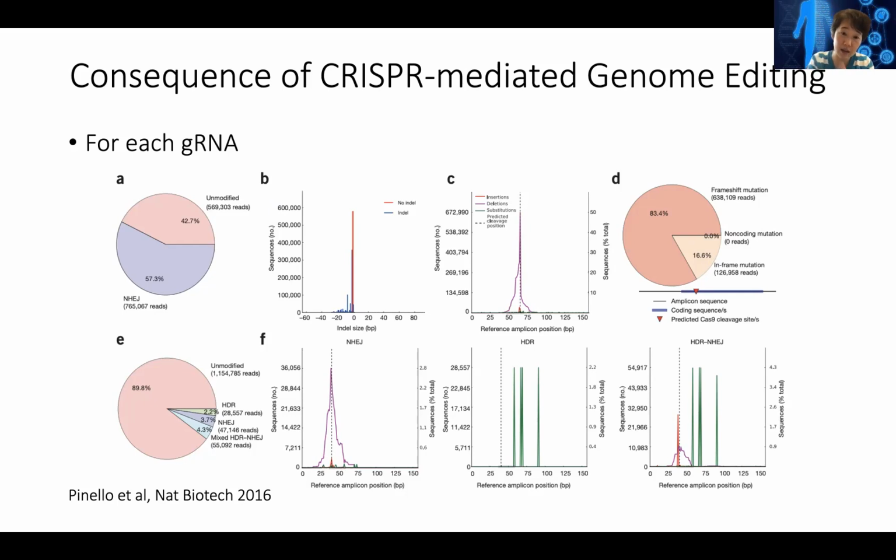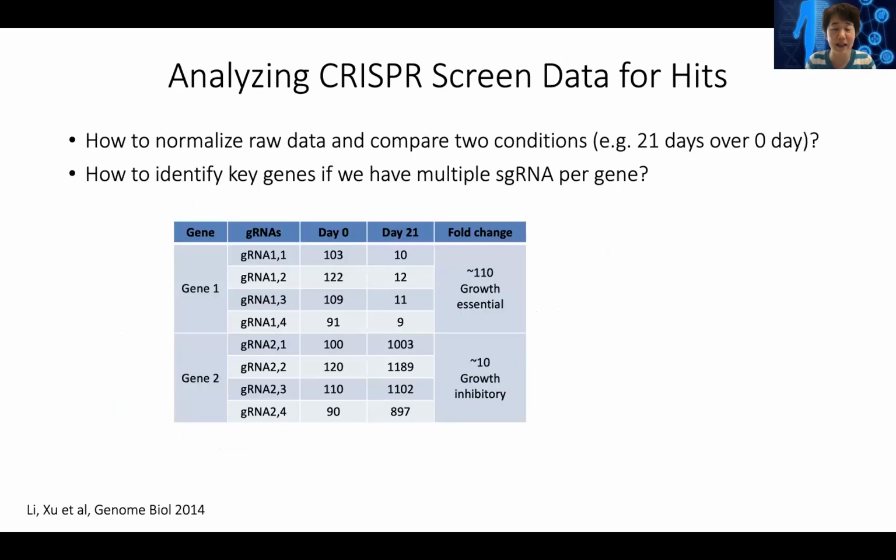It's again just a single cut at a time, but you PCR amplify this region out from all the different cells that carry this guide RNA for the genome editing, and you read out the sequence by high throughput sequencing to understand the actual repair result in that cell and understand whether that gene gets knocked out.